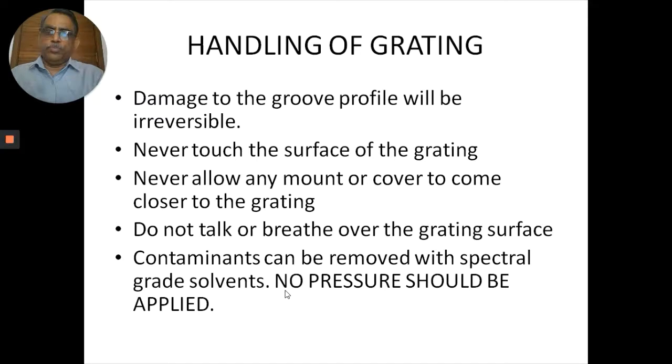But generally one should not clean it. Over years of usage you will see dust accumulation. For dust, you can use a mild air pump, like the bulb of the pipette master that you are using, and blow it, so you will see the dust going away. That's a normal exercise of cleaning of optics one has to do.